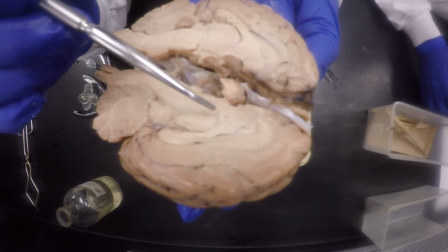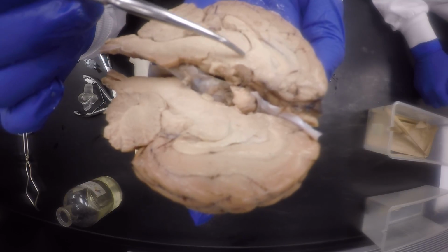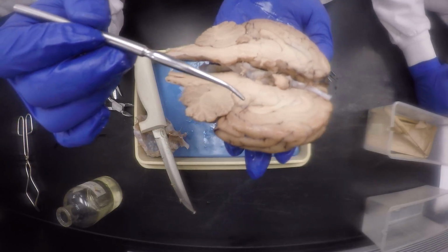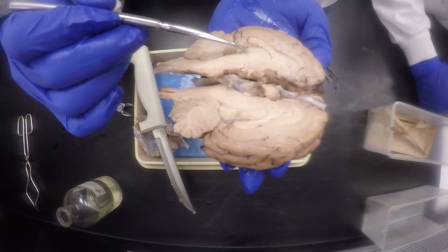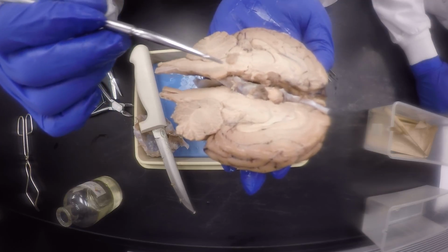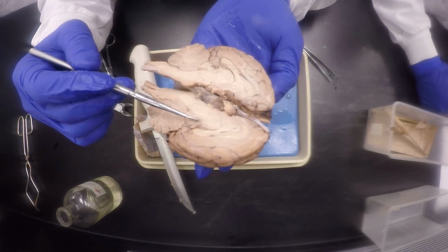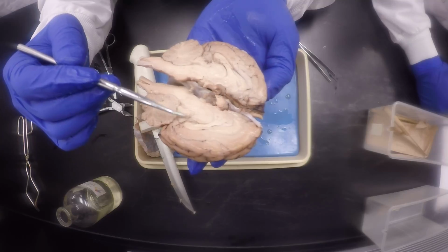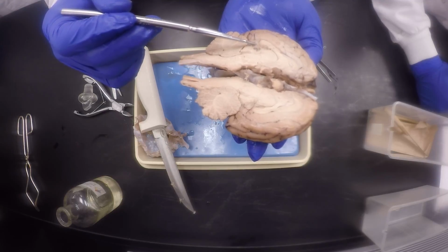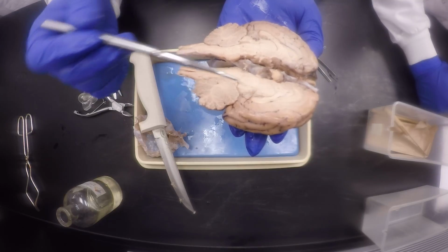So this is the corpus callosum, and there's a little hole there, where the anterior commissure is right there. Okay? And over here there's a little line, on mine it's not showing so nicely, which is the posterior commissure, because it's on the posterior side, and it joins the left and right side. So this is my pineal body that got cut off. Make sure when you cut it, so I gotta put mine back right here, boom, like that. Yay, it worked. So there's the pineal gland, and the line that goes down there is the posterior commissure.